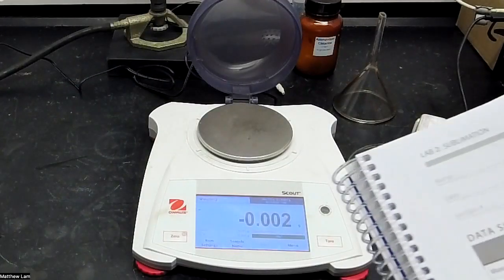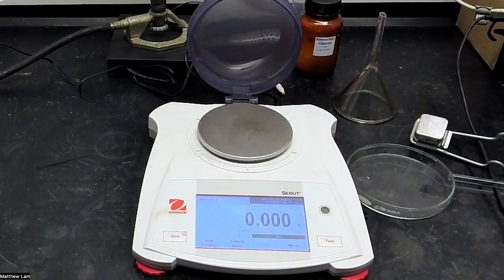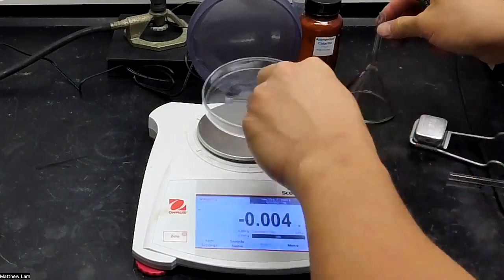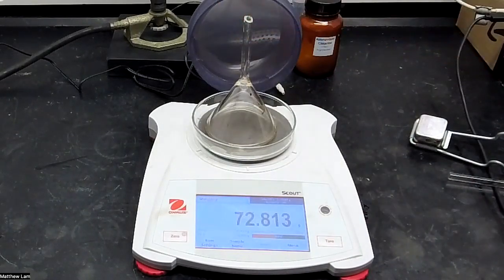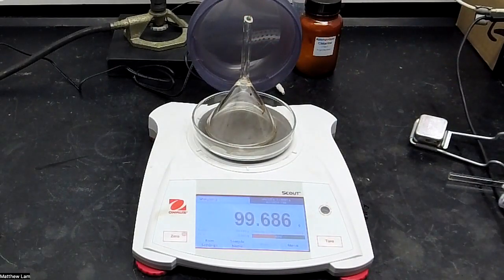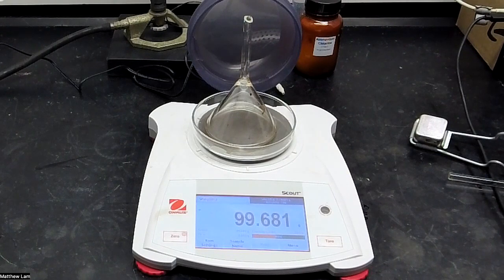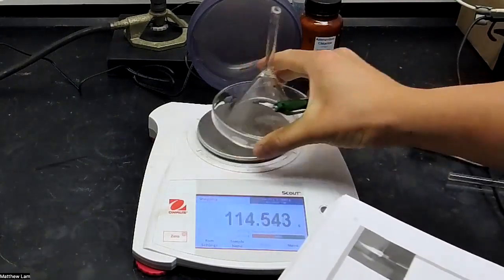Then they want us to measure the mass of the Petri dish half and a clean funnel. So we'll put that up there and our clean funnel. We'll weigh that together. That comes out to 99.681 grams.